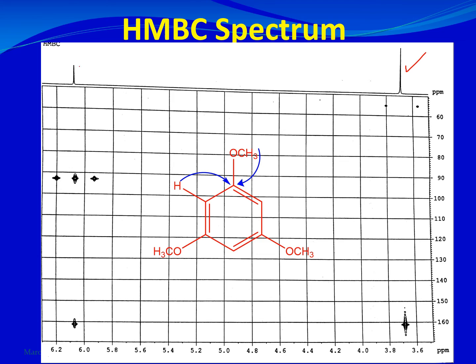In this trisubstituted benzene ring example, there are only two types of protons: the three methoxy groups give one signal and the three aromatic protons give another signal. Underneath the methoxy signal at about 3.7 ppm, one contour meets the carbon scale at about 162 ppm — this is the correlation of the CH3 proton with a quaternary carbon. That same quaternary carbon at 162 ppm also correlates with the aromatic proton at about 6.08 ppm, representing a two-bond and a three-bond correlation respectively.